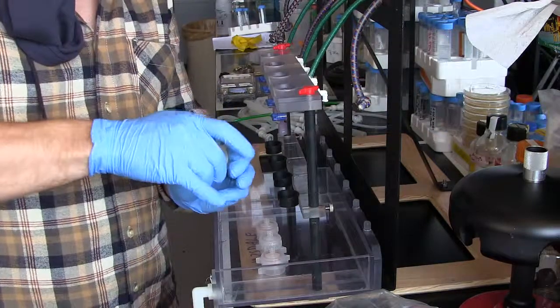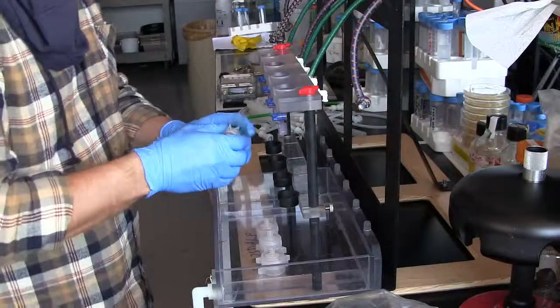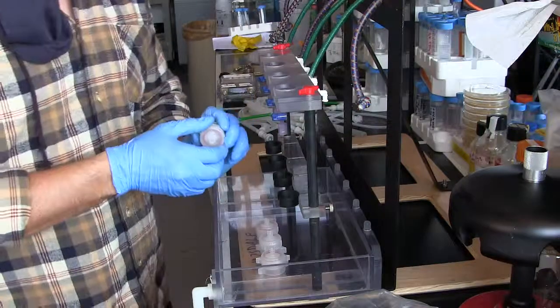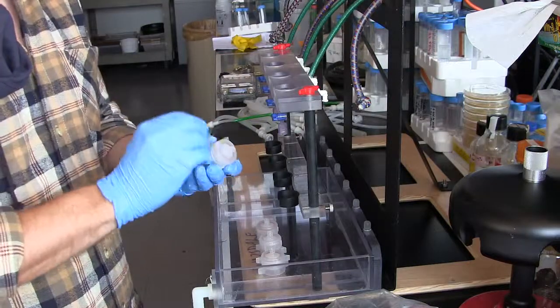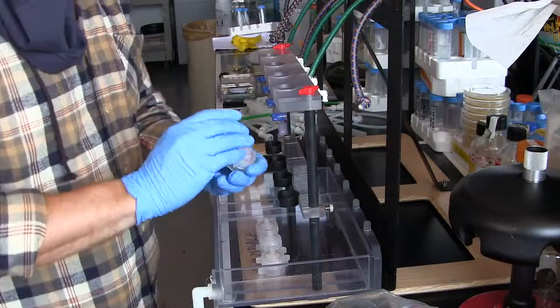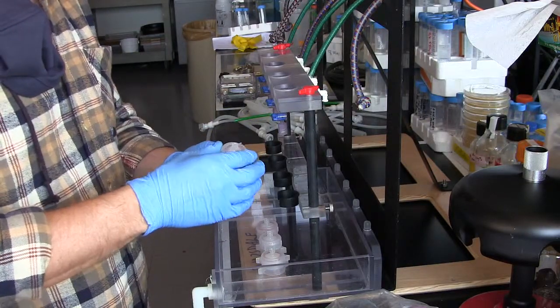Okay, so you tighten your ring, don't over tighten the ring, just make it finger tight, just snug it up. If it is too loose, you'll start to notice leakage coming through here, but for example with particulate organic matter samples, sometimes because the GFF we use is a very thick filter, it's possible to over tighten this top ring and no water will flow through. If that happens, you have to back it off a little bit, allow some water flow, and then just snug it up again.